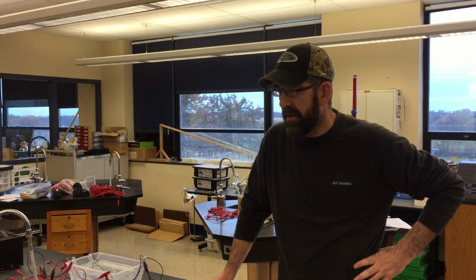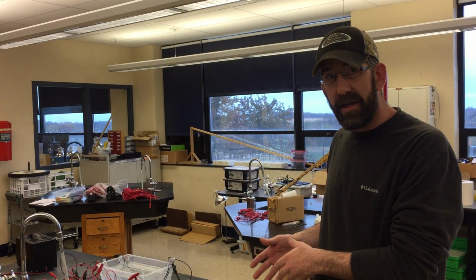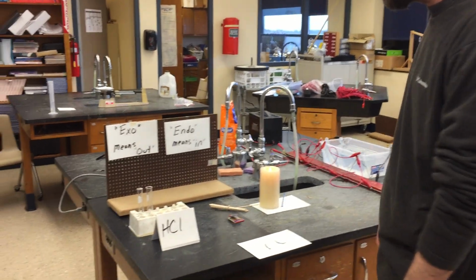All right, we're here with part 2 of this lab that we wanted to do with you today. This is going to be an exothermic reaction. Exo meaning heat out. Heat's going to be coming out after the reaction takes place, specifically on the product side of the reaction. So over here we have a little setup that I want to introduce to you.